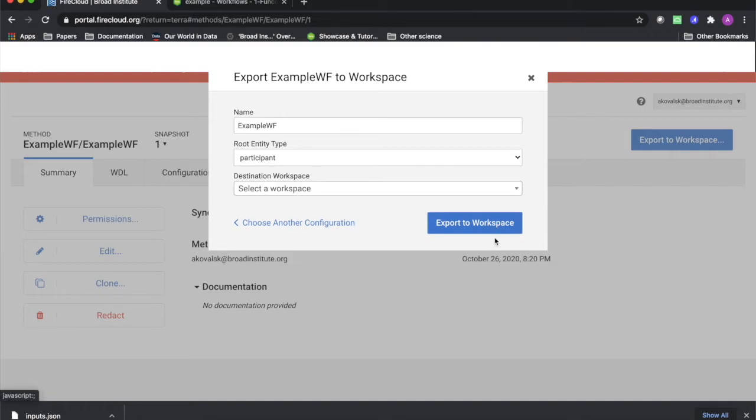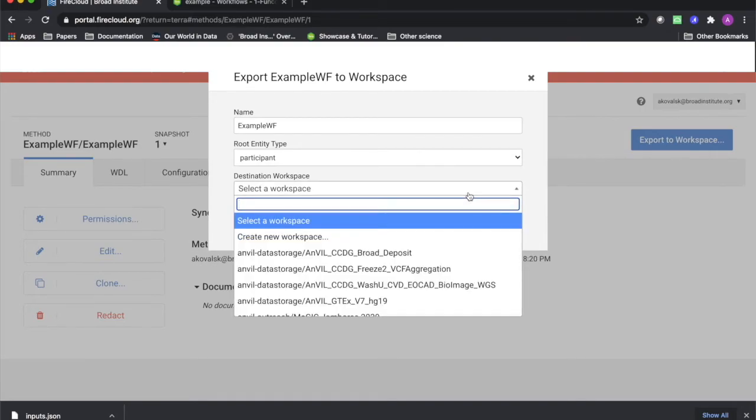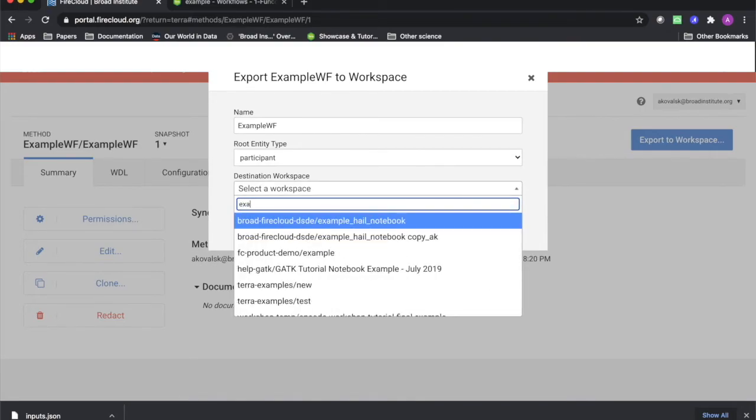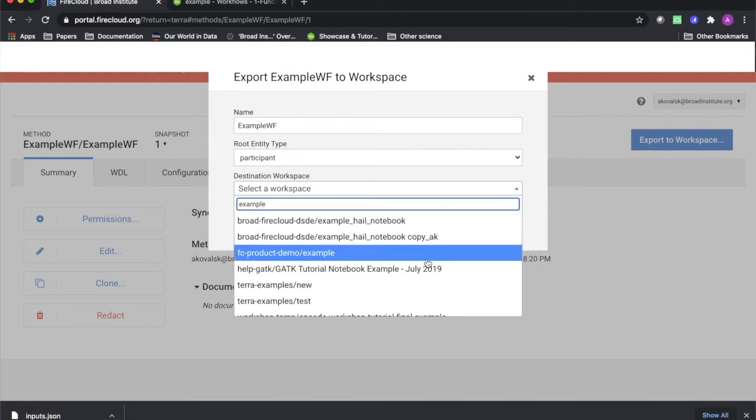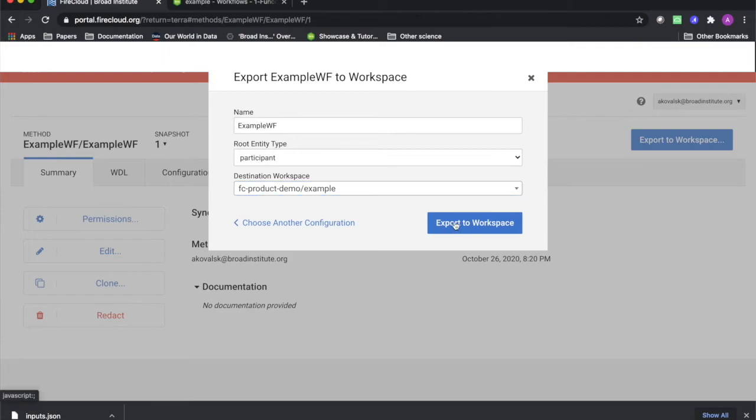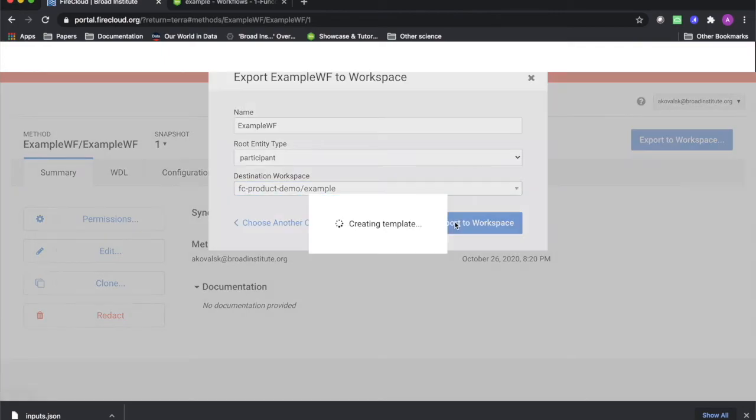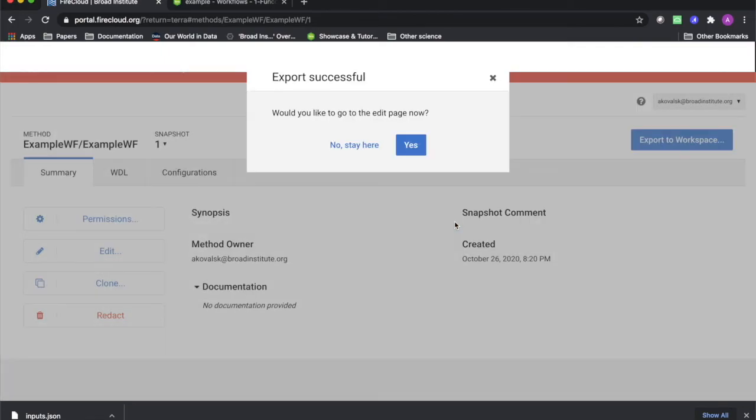After clicking Use Blank Configuration, or selecting a configuration if available, you will be prompted to choose the destination workspace. Make sure to type in the correct name of the target workspace precisely.